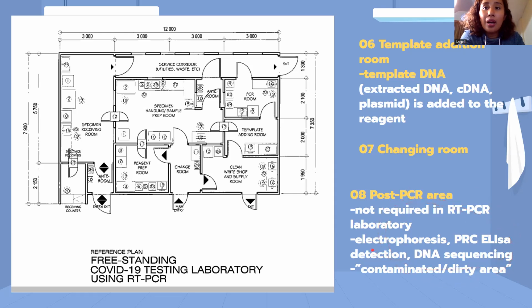And we have post-PCR area. So in our laboratory in University of Baguio, we have post-PCR area because we only have thermocycler. However, if you are an RT-PCR laboratory, you don't need a post-PCR area anymore because the results will already be apparent in the RT-PCR. Andun agad yung result. Pero kasi pag thermocycler lang, guys, further processing is required.